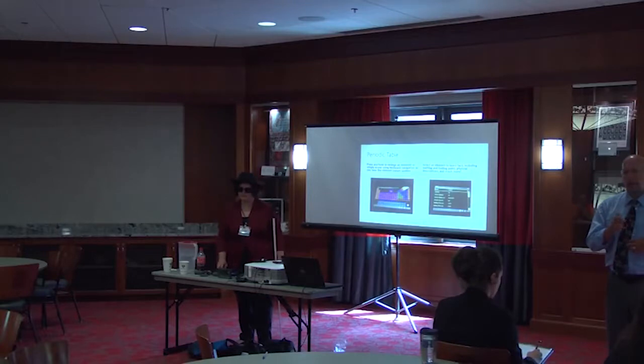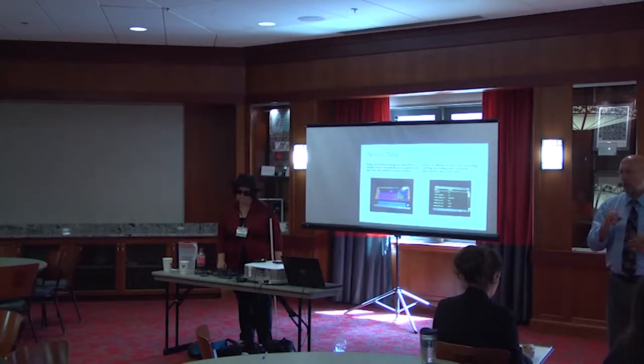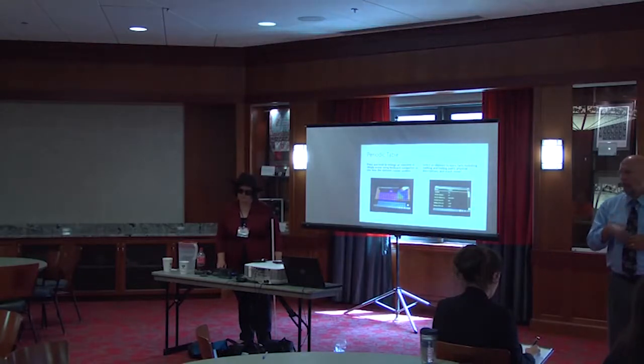I guess, are you familiar with the LabQuest Minis? Yes. We don't have to use the LabQuest in our labs because we have the Minis that work with the computer. Does your software work with the Minis? So can we use that for the lab? There's a version of Logger Pro that's simply on the computer, and you can use communication with that, and that will work for the Logger Pro system.